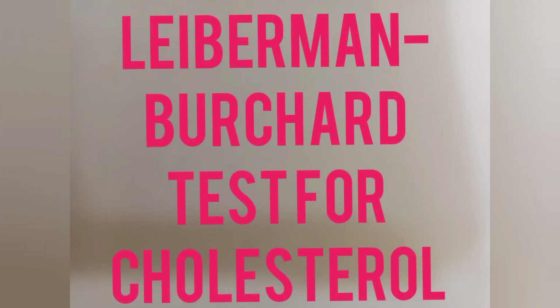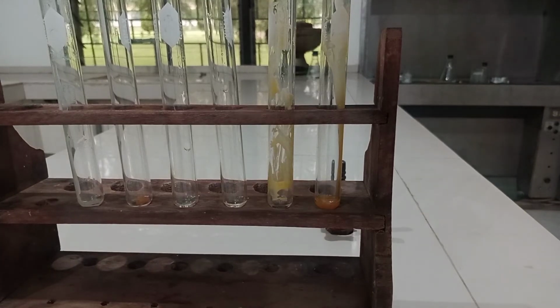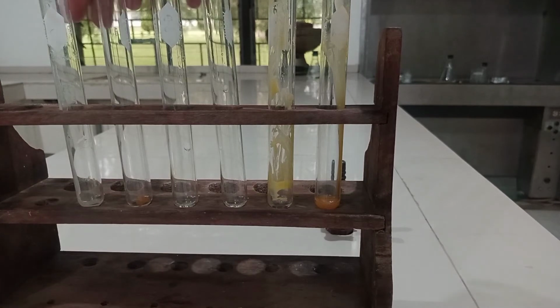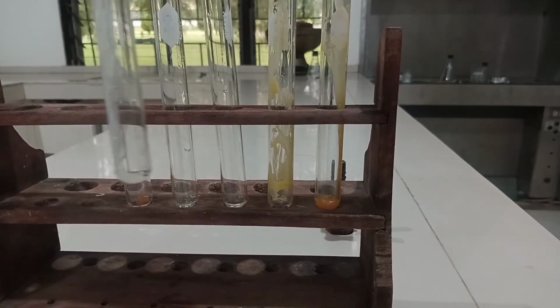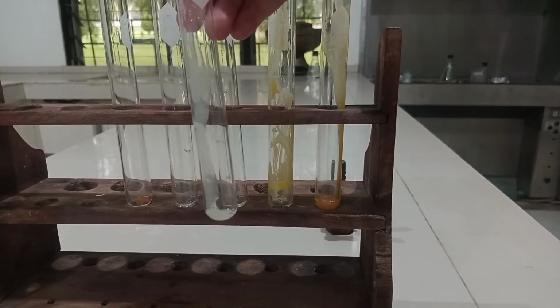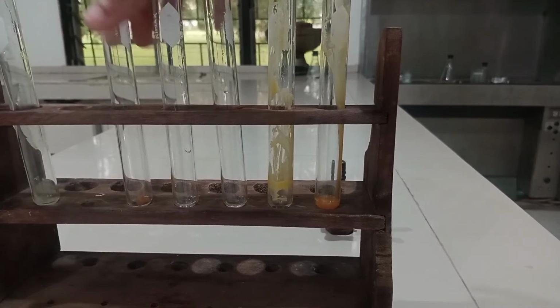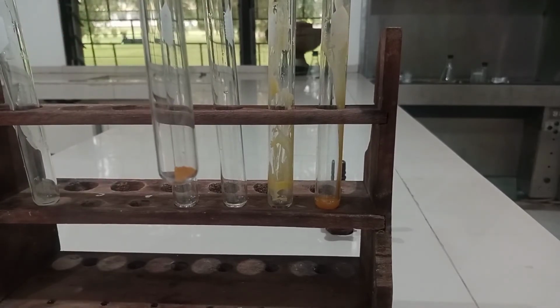Liebermann-Burchard test for cholesterol. There are 6 test tubes, and each test tube has a sample. First test tube is cholesterol. Second is lecithin.